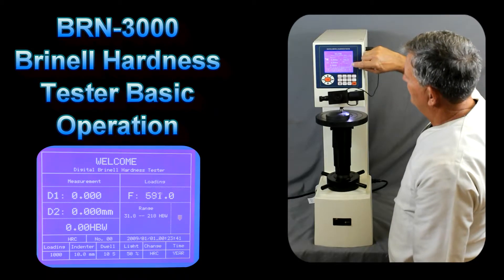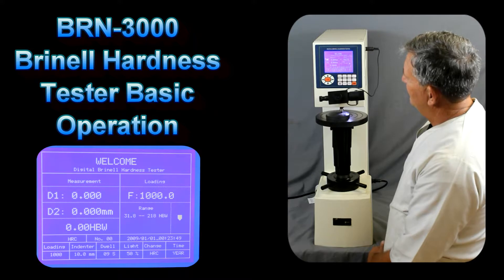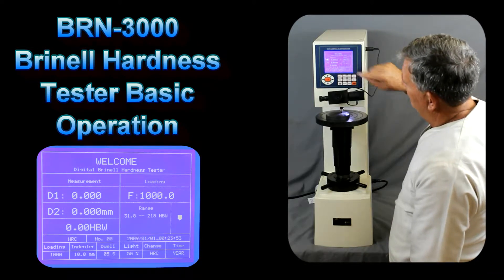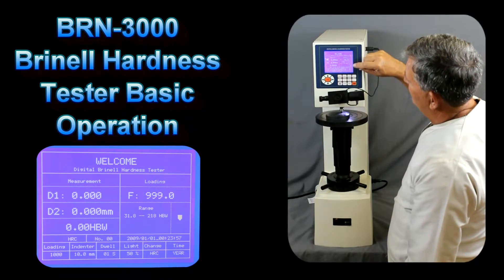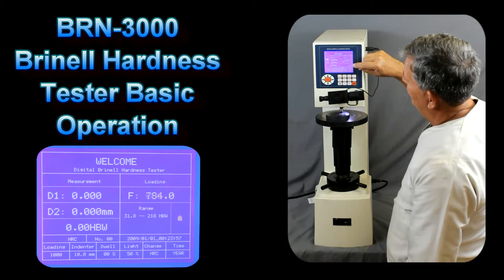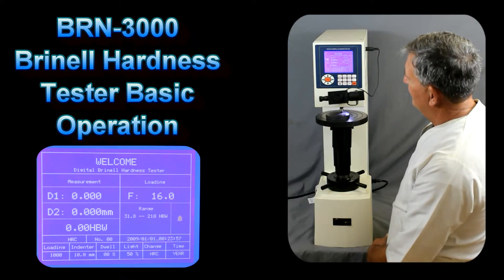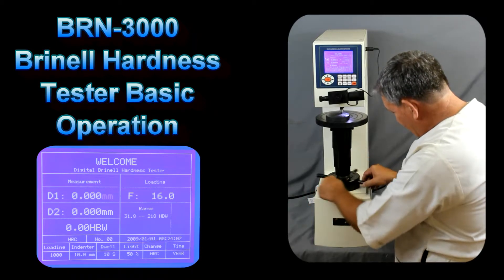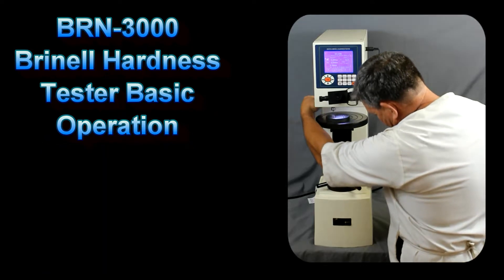At this point an arrow is flashing — this indicates the major load is being applied to the specimen. Once that's reached, the dwell time will count down to zero. After that's complete, it will flash again showing that the indenter is being raised, and a second chirp confirms the load has been removed. Now let's go ahead and lower the stage a bit and rotate the optics back into place.